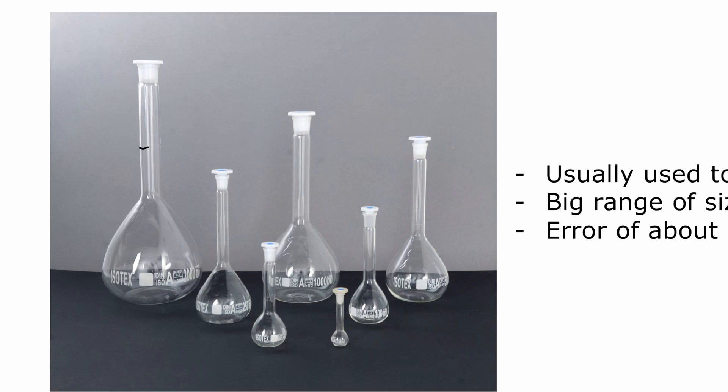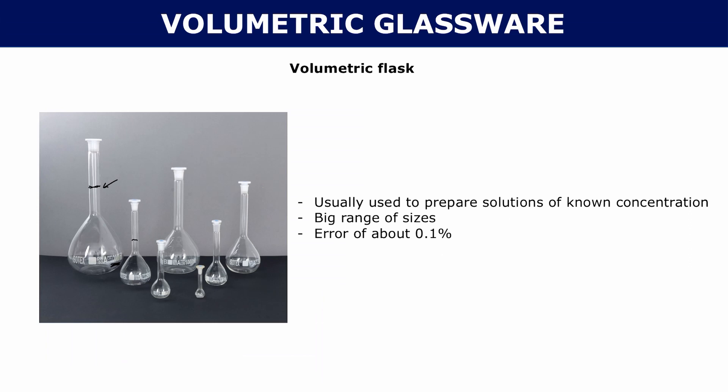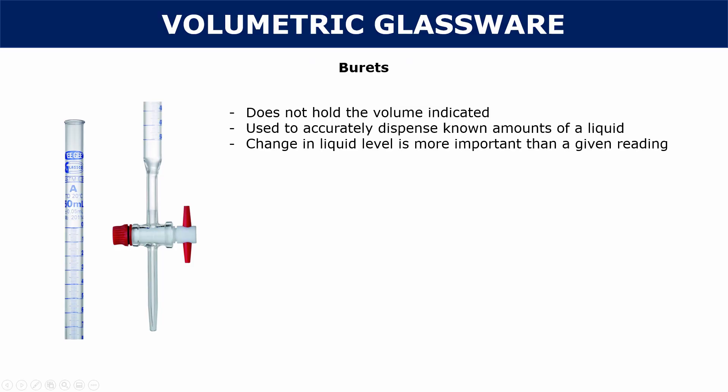The volumetric flask all the way to the left here is a 2,000 mil volumetric flask. Once you've filled up to this line here, then that means you have 2,000 mils. Unlike a graduated cylinder, you don't have the type of markings all around the volumetric flask to tell you that you have maybe 1,000 mils or 500 mils. You only have one marking that tells you that you have 2,000 mils. Volumetric flasks, just like graduated cylinders, are really accurate. They have an error of about 0.1%.